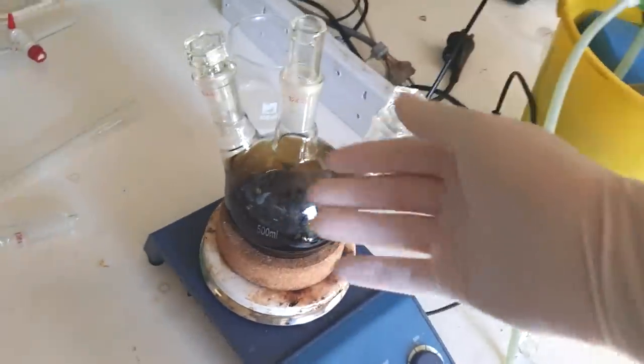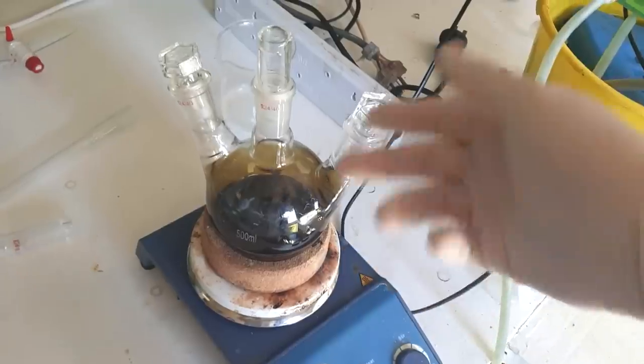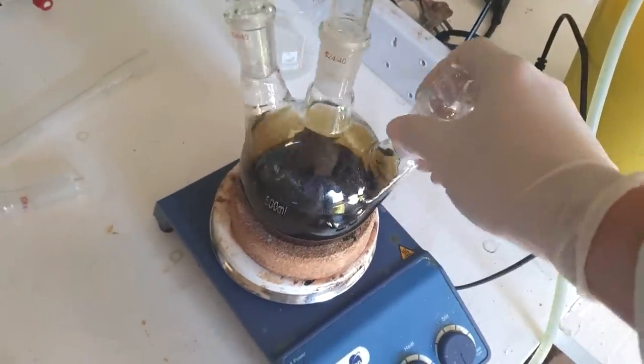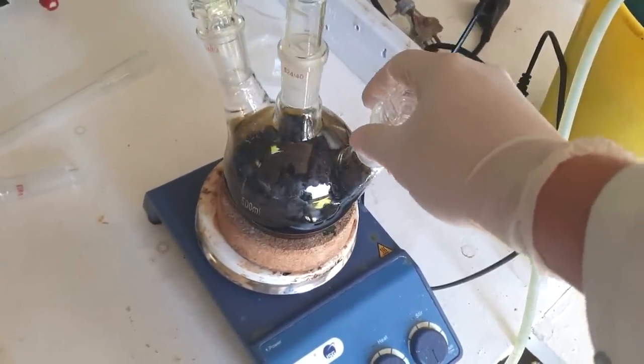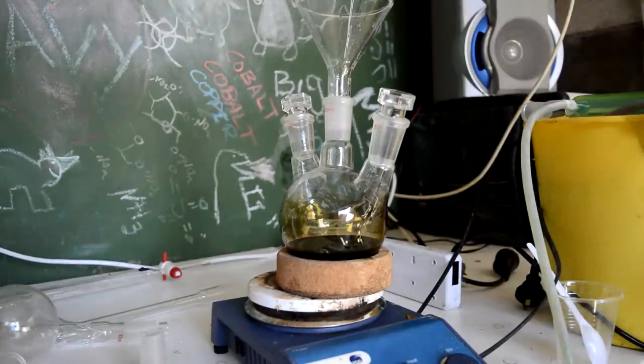We know there's a lot of acid in there, so our next step is really to put it in the SEP funnel and do washings with sodium hydroxide solution. It's really just neutralizing it. But because we got so much acid in this really thick solution here, I'm just going to be adding some sodium carbonate to this flask here, and we'll stir it around and let it get most of the acid out that way. Oh, yeah, there's no reaction.